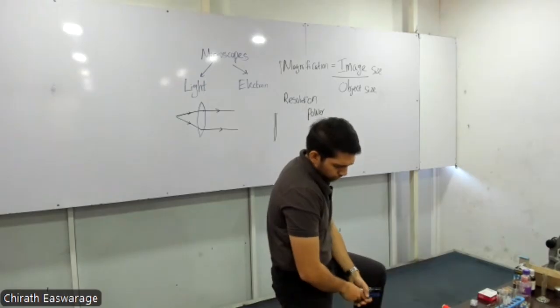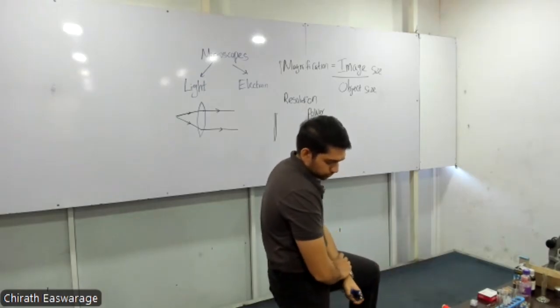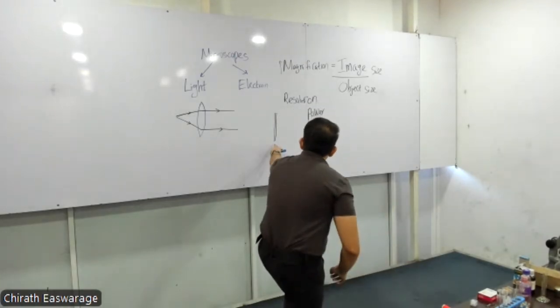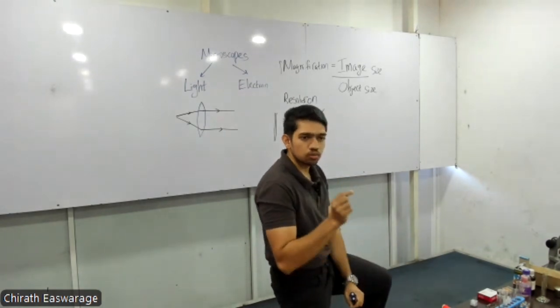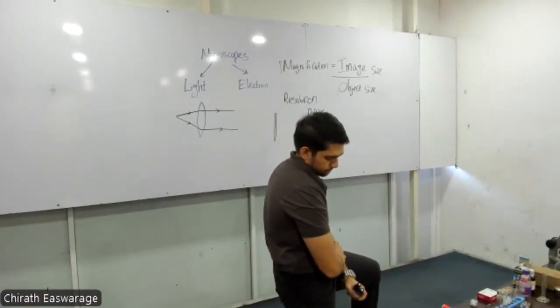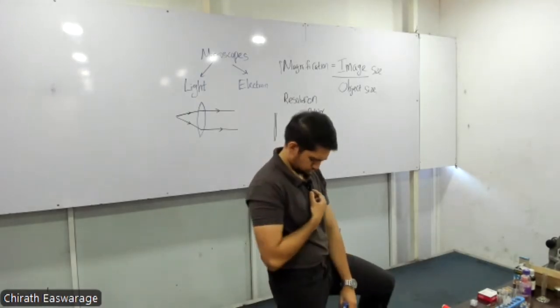Okay. So it says, page 22, resolution power of the light microscope is 0.2 micrometers. Right? For the light microscope, the minimum distance between two objects that we can see is 0.2 micrometers. These are MCQ points. Okay, highlight. It's a measure of the clarity of the image.